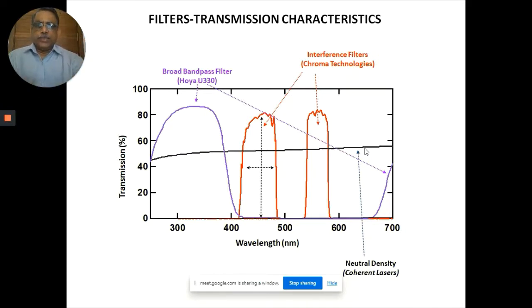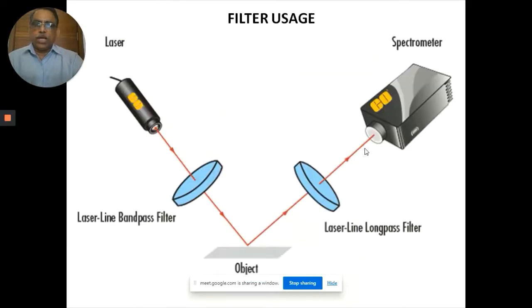An ND filter is something like, you can use even a thin layer of filter papers or lens cleaning tissues. It is like a grid mechanism. Otherwise, you can have small layers of a coating with a small thickness, so that will help you to work like an ND filter. Let us see some examples and how they look.